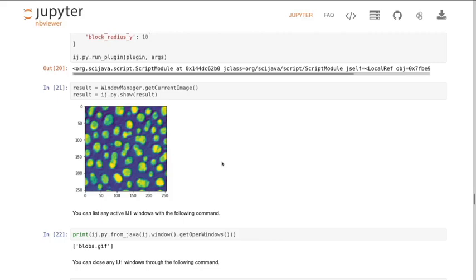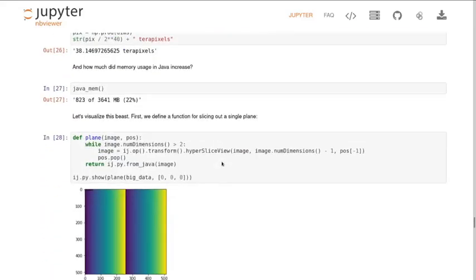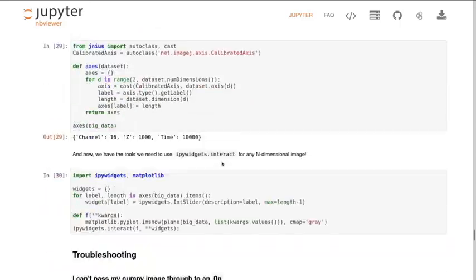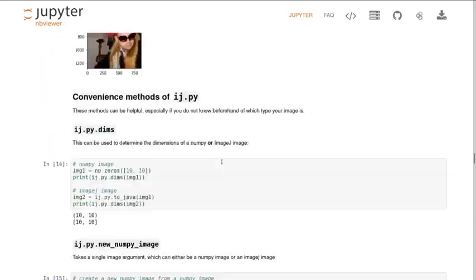The other key point, if anyone has used ImageJ apps already or indeed if anyone writes ImageJ macros quite a lot, the format of actually getting ImageJ to do things should be relatively, by ImageJ to do things, should be relatively familiar. In that, I think, if you write your macros in JSON like Todd showed on Monday, you'll do things like this in the middle of your macros.